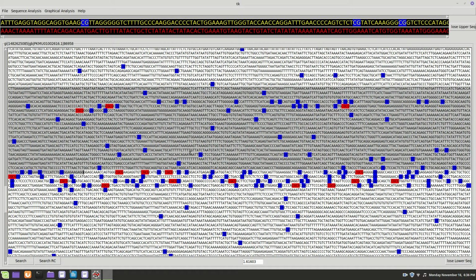Most of what you're going to be doing will be in these like 3 or 4 lines here. I realize these are longer than the ones you'll see in whatever you're doing. You'll probably have to chop it up a little. But the 1,000 base pairs between here and up here, this is where most of your regulatory, your promoter, pre-promoter region is, that's where the things you're looking for are probably at.